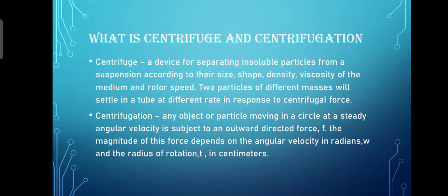What is centrifuge and centrifugation? A centrifuge is a device used for separating insoluble particles from a suspension according to their size, shape, density, viscosity of the medium, and rotor speed. Two particles of different masses will settle in a tube at a different rate in response to centrifugal force.